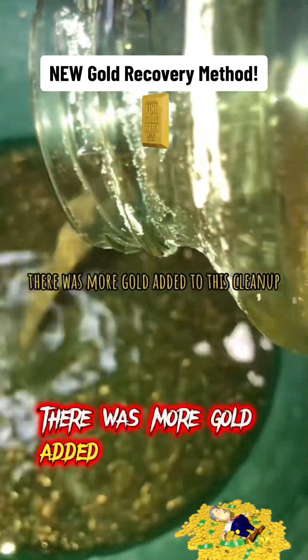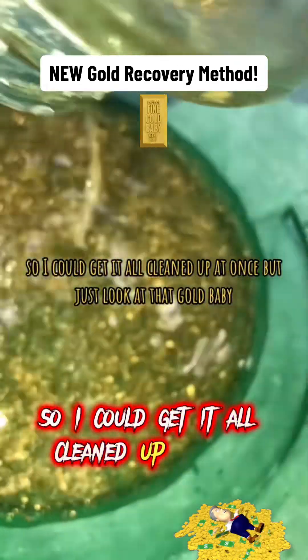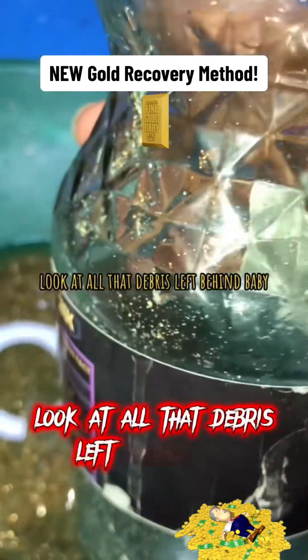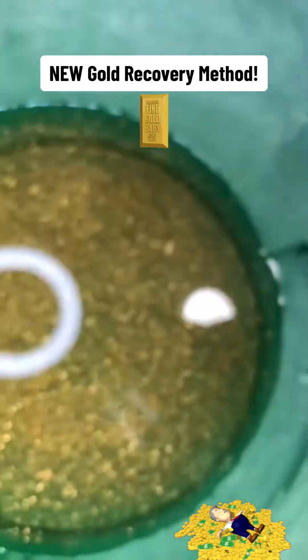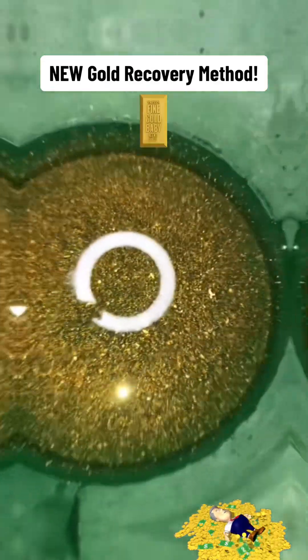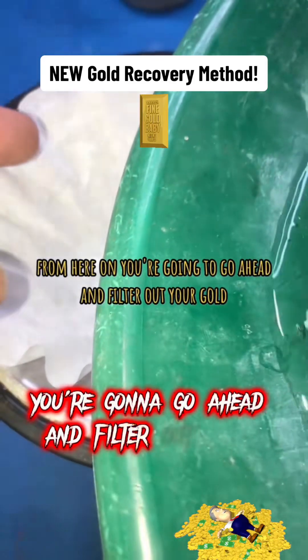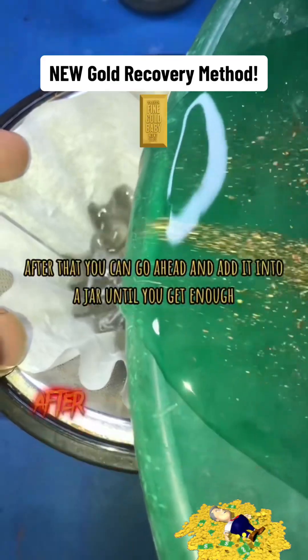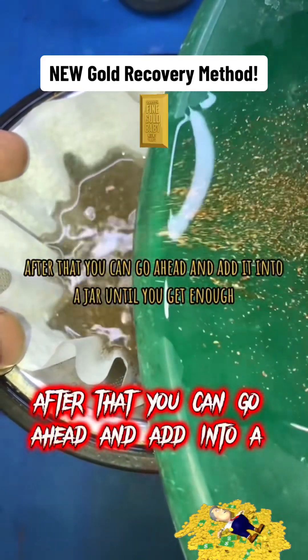There was more gold added to this cleanup so I could get it all cleaned up at once, but just look at that gold. Look at all that debris left behind. From here on, you're going to go ahead and filter out your gold. Let it dry out for about 6 to 12 hours. After that, you can go ahead and add it into a jar until you get enough.